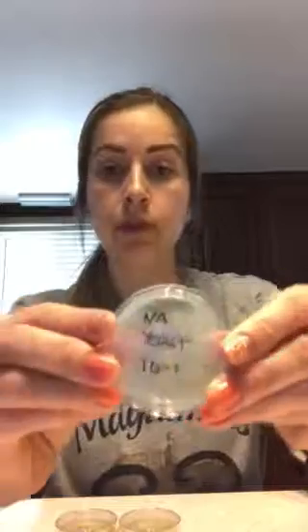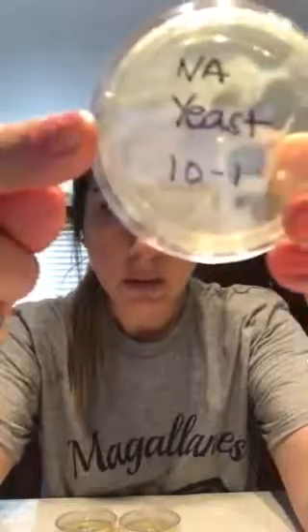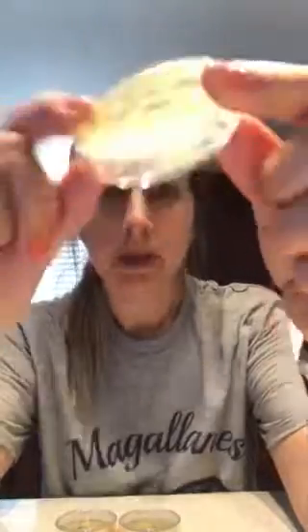The first one doesn't have many colonies you can actually distinguish — most of it is just stuck together, with the exception of maybe one. This one was too numerous to count because they're all bunched together. I know there's a lot there because you can see growth, but you can't distinguish individual colonies.